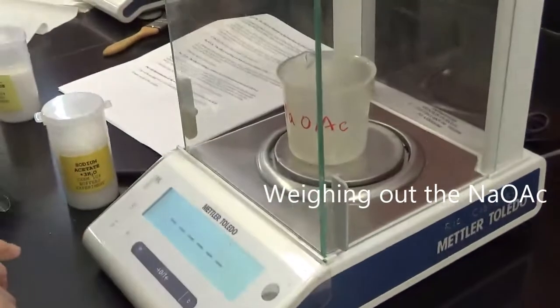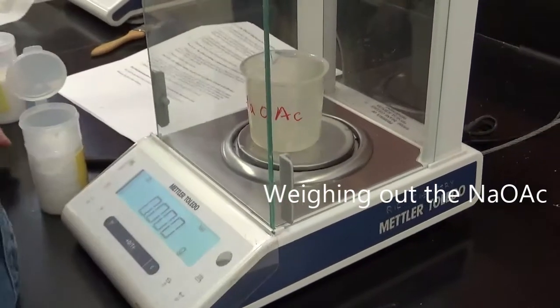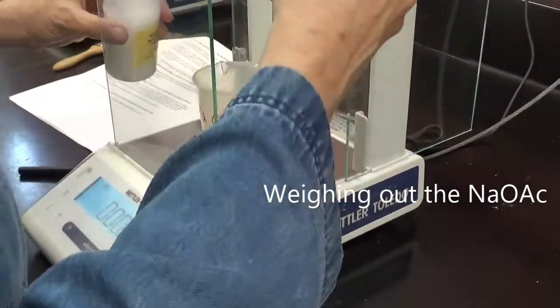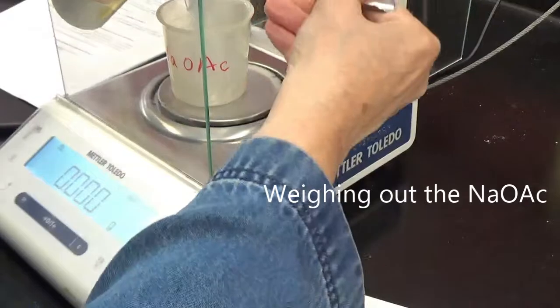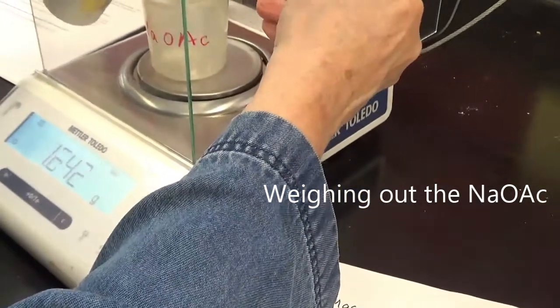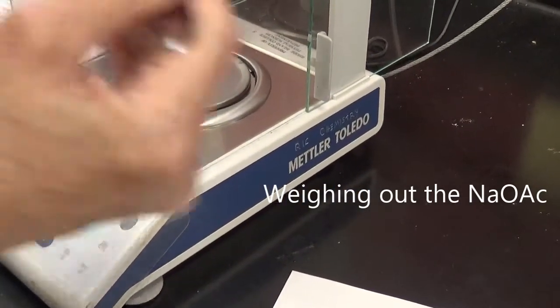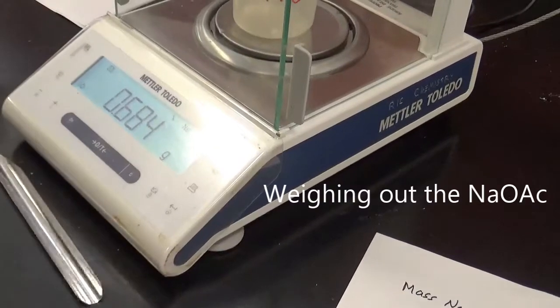Again, I will tare this. Okay. And now this is supposed to be around 0.68. So break this up a little first. 0.684.